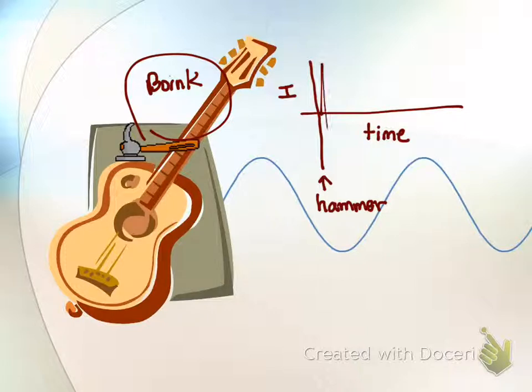But what happens is it goes like this. There's a lot of noise here, and then it's going to go like this. Why does it get smaller? Yeah, the energy is slowly absorbed by your body in the shower, right? Slowly the energy is dissipated. That's why we're hearing a sound, and as the energy gets dissipated, eventually it goes to zero. This is known as an FID.